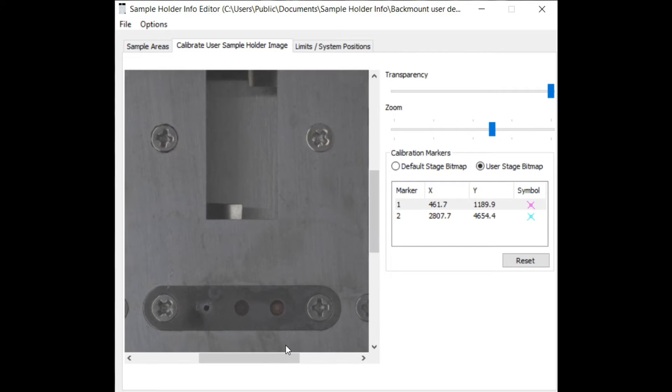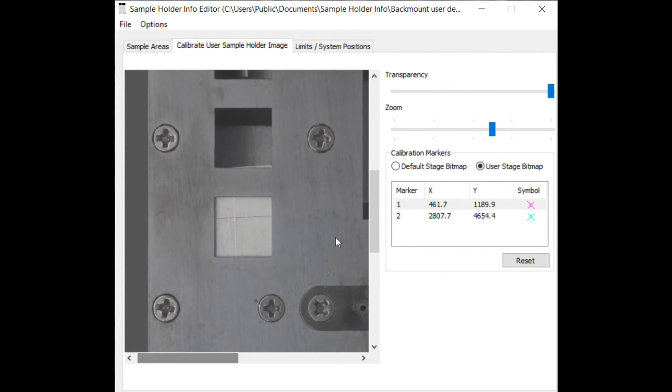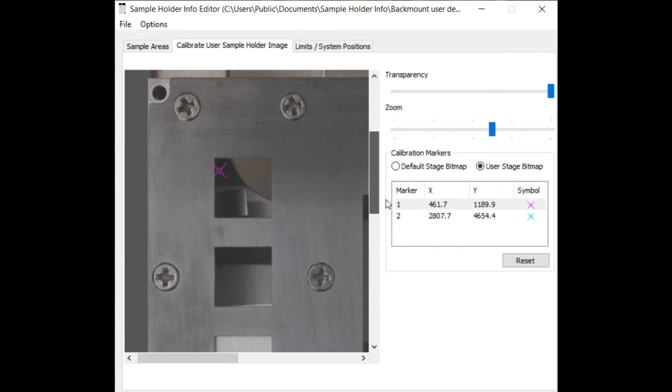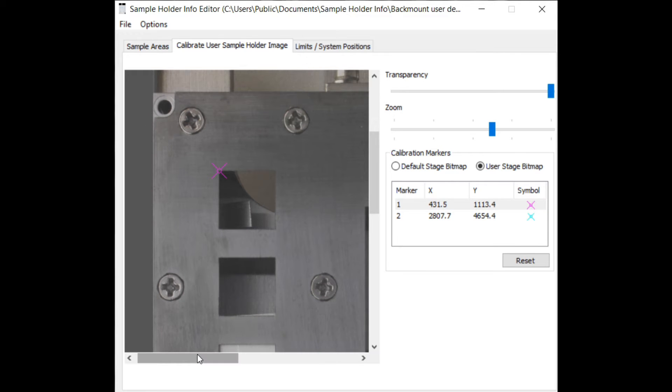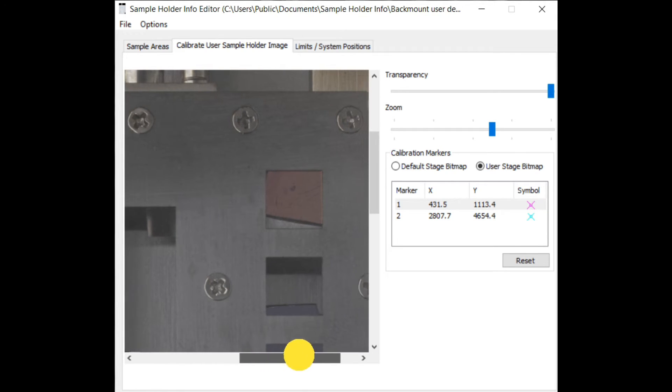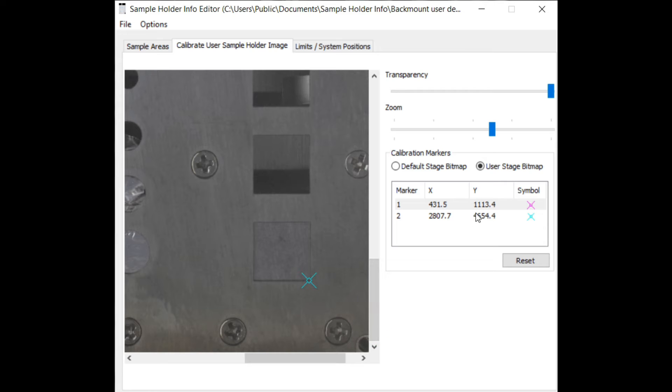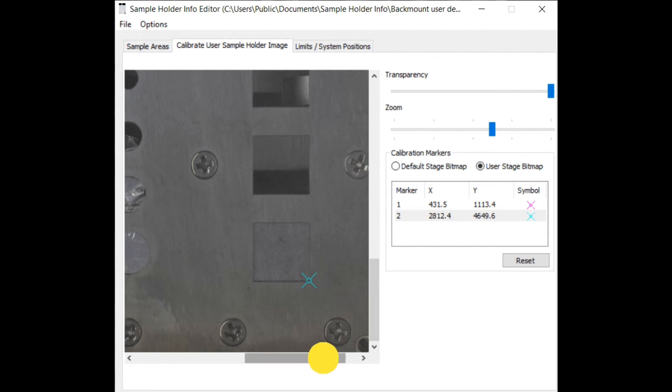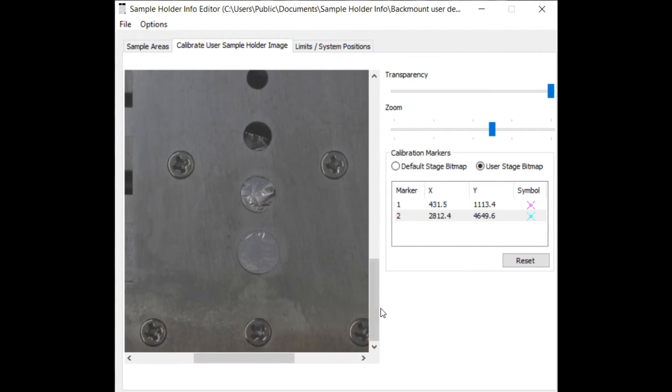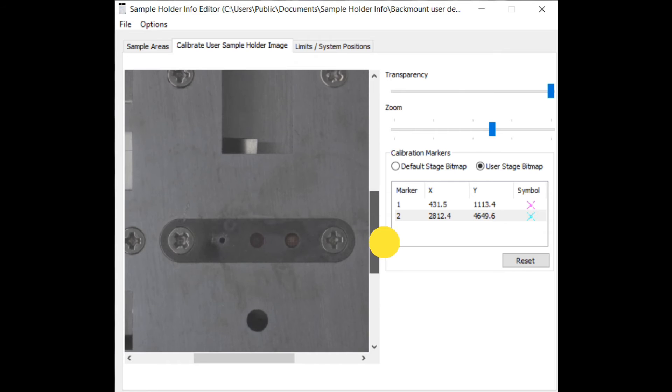Specify two points with the marker. Suited points are as far as possible separated in both X and Y direction. For precise positioning use the zoom slider. Repeat the steps with the second sample holder image by specifying the same points.